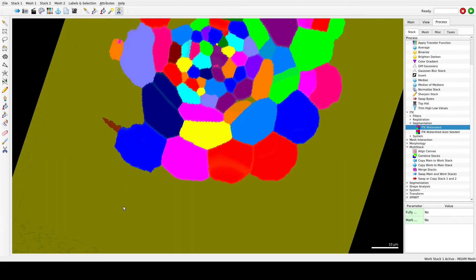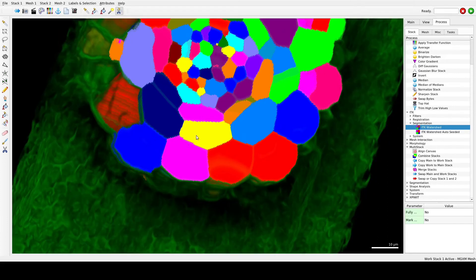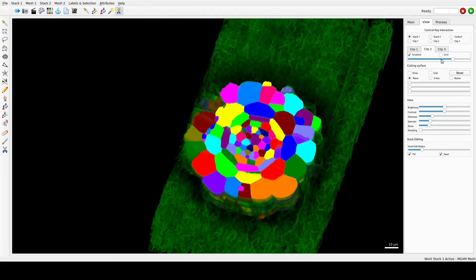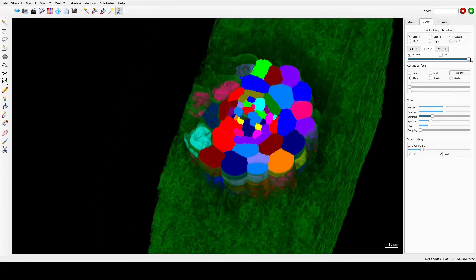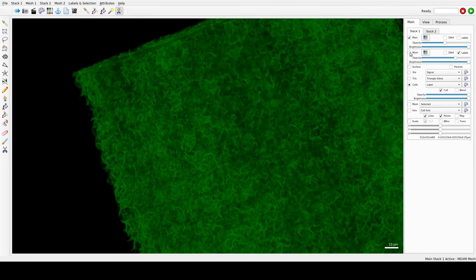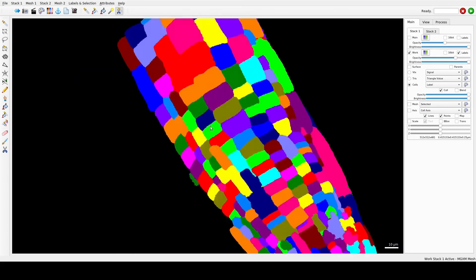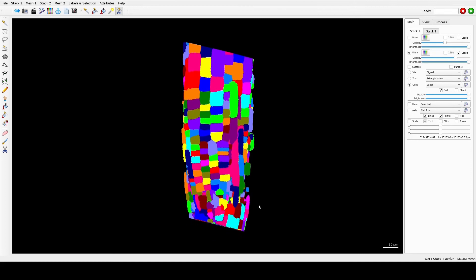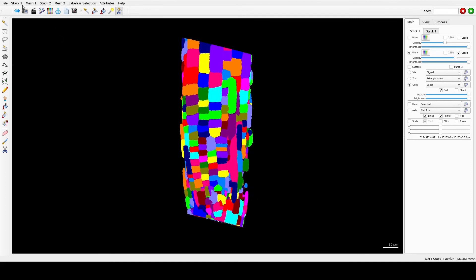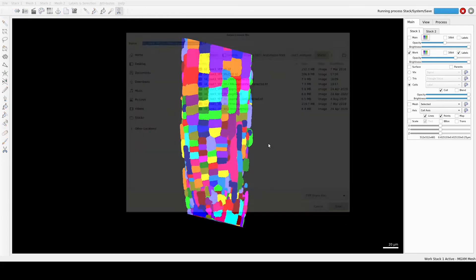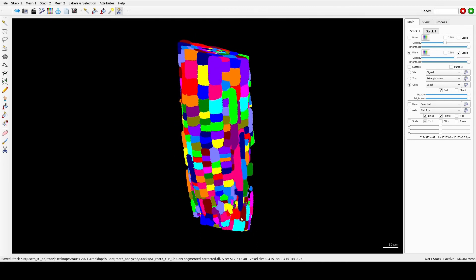Now we remove the background again. We can see the two cells are now segmented. Now we have all the cells segmented — we can save it again as corrected. You can always spend some more time on it.